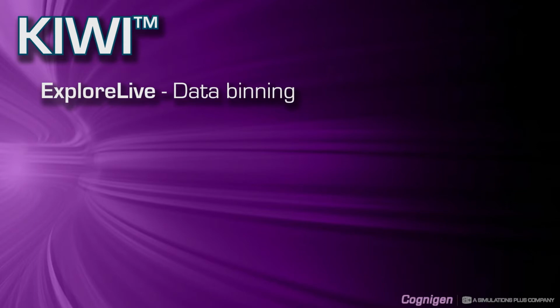Hello and welcome. In this tutorial video, I will demonstrate how you can perform small-scale data binning evaluation in the KIWI ExploreLive module.